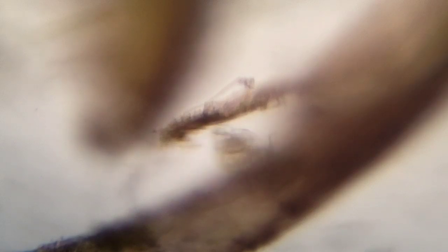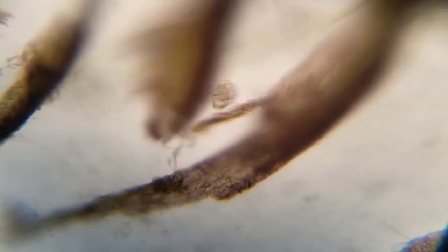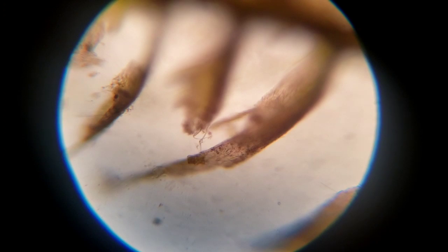Here we have some single-cell organism — I can't tell quite what it is, but this is food for things like other zooplankton that are larger, little crustaceans and things. This actually looks like it may be a tardigrade type critter. It has a little hog nose on its face, but it's spinning around oddly and it has some legs like flagella legs. It's hard to tell without it being dyed, but yes — this is a little tardigrade or related species. These things can survive literally up in space — it is bonkers. They just kind of move around and crawl around and kind of look like a little pig, so sometimes they're called water bears or water pigs. They can survive in the vacuum of space — they're a very, very hardy creature.